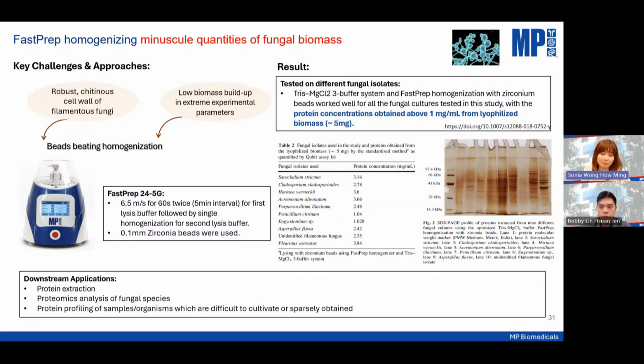In this paper, with this complete homogenization, the researchers successfully proceeded with downstream applications of protein extraction, proteomics analysis of the fungus species stated here, as well as protein profiling of samples or organisms which are difficult to cultivate or sparsely obtained.